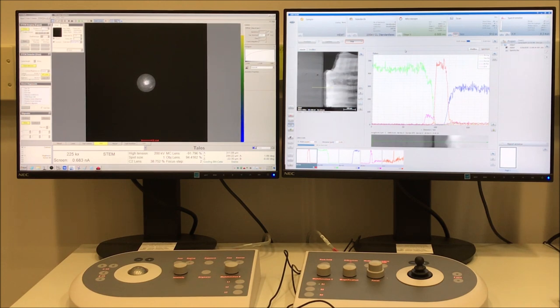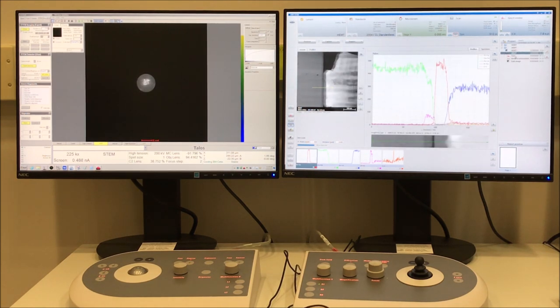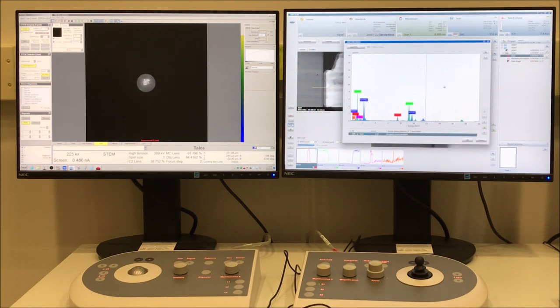And then again, you should blank the beam once you're done and ready to do some manipulating of the data. I didn't do that here, but I should have. And so I will go ahead. We'll use that input output button to send to the project, and then we can do some manipulating. You can select that folder that is from the line scan, and then you can open the image. You can see the image with the line scan that you can then save. If you expand underneath it, you can see the sum spectrum, which again can be manipulated and exported.